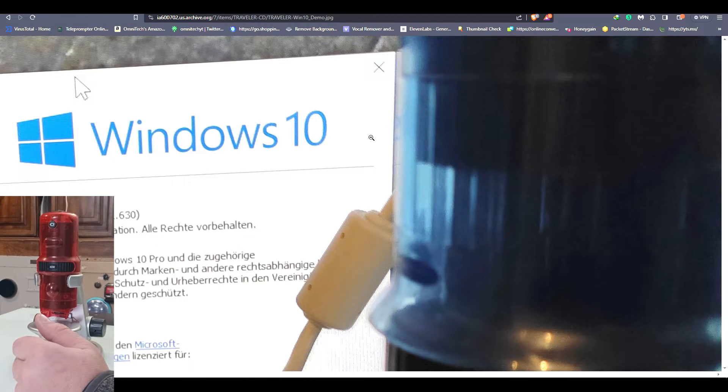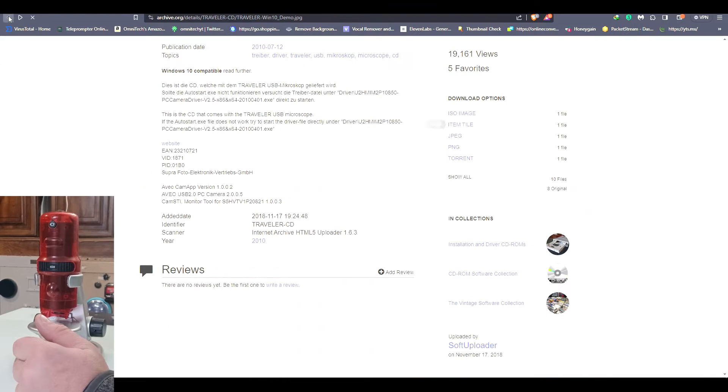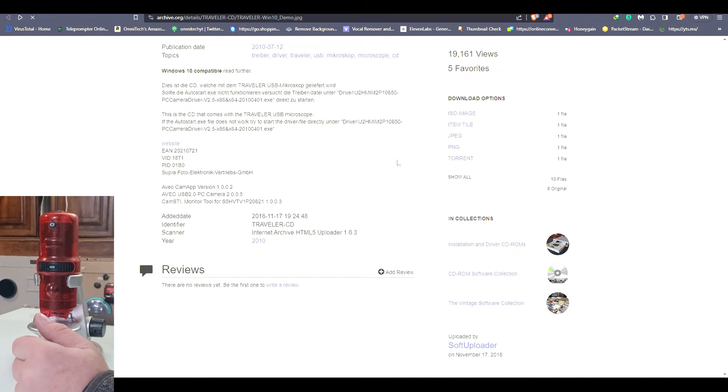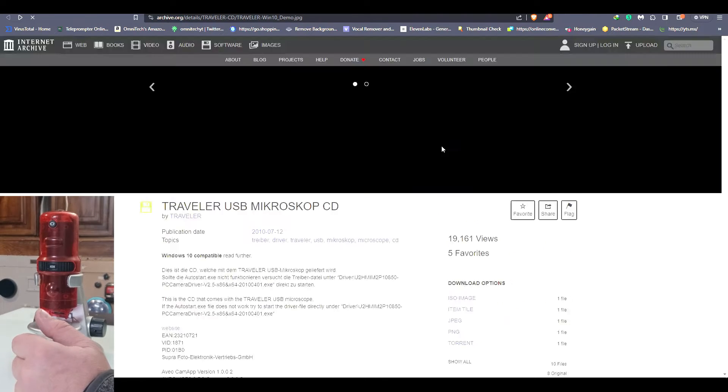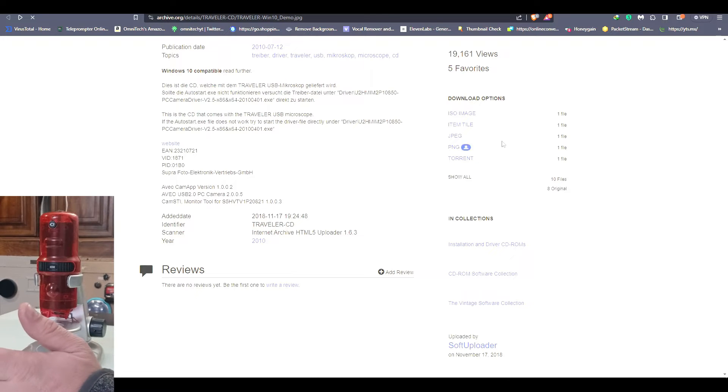Let me get rid of this file thingy here. You can download any of these here. Myself, I went with a torrent because it was easier to download.